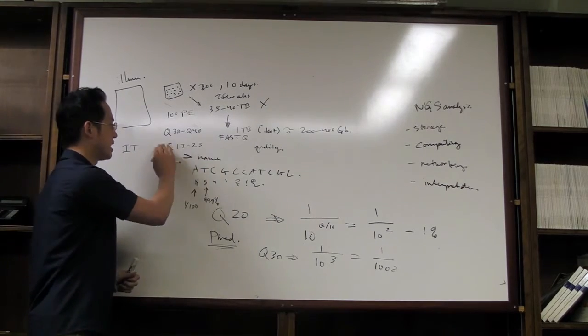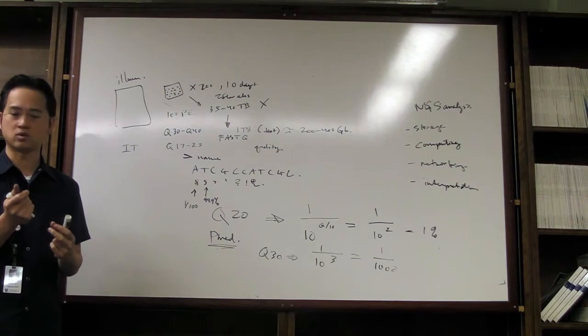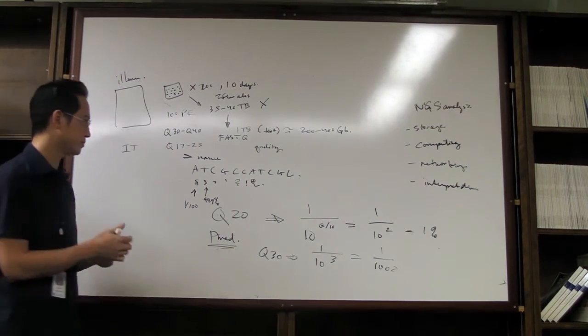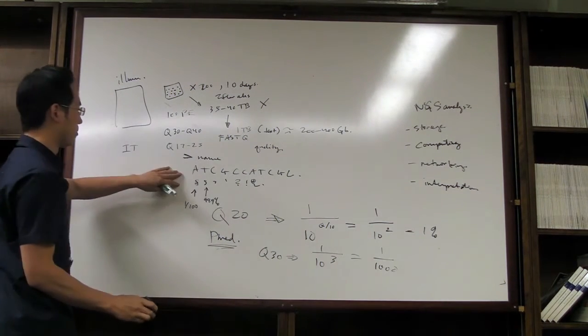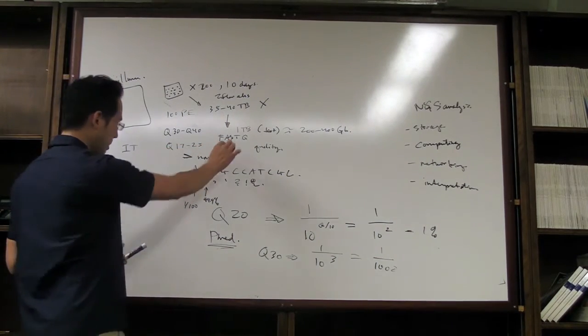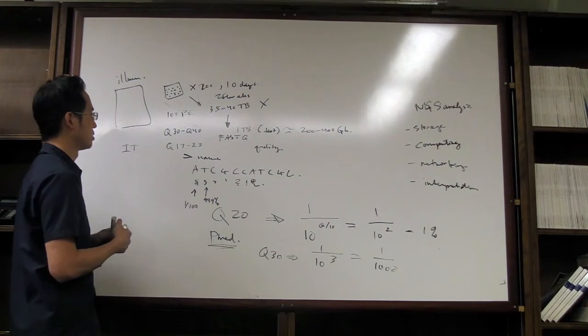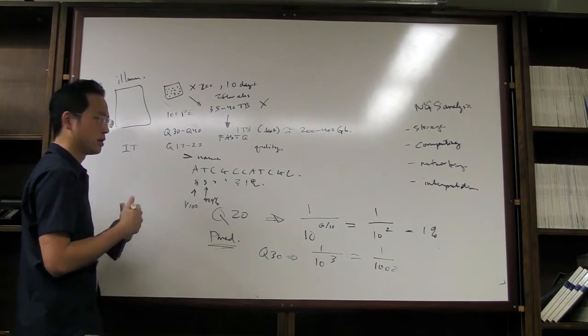But anyway, you get this data back and you have these quality scores, which will be very useful downstream in terms of doing analysis. Okay, so that's the data format. Most of them give you a FASTQ score, I mean a quality score in a FASTQ formatted file for the sequence data. I'm sure there are other formats.